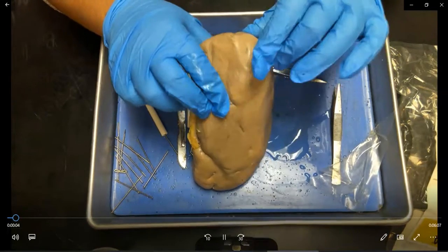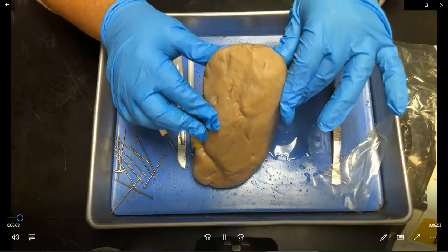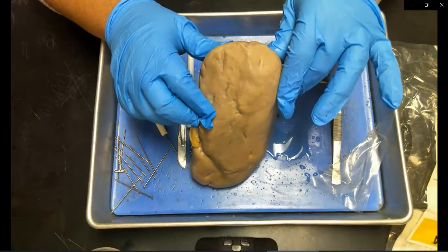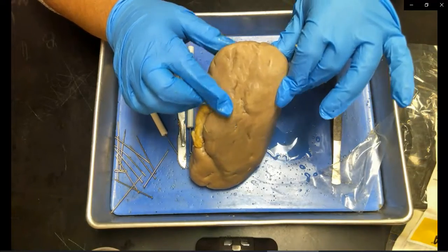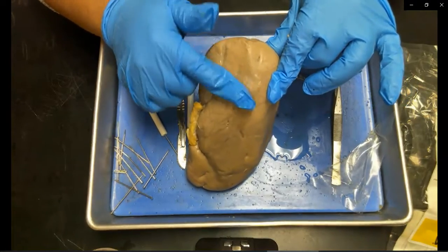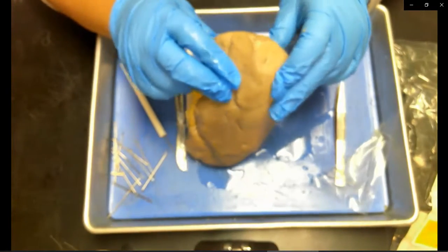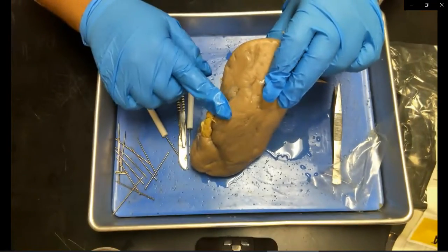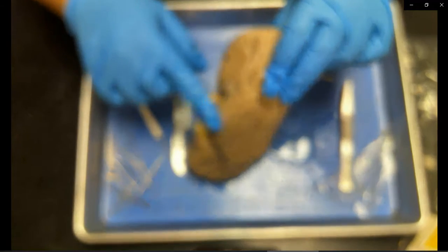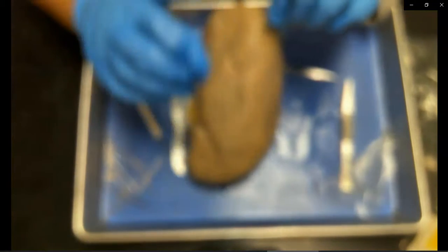Alright, hey guys, so I am going to do a dissection for you. This is a really large kidney that we found in the back of our anatomy closet. So this would be the top of the kidney. You see how it's kind of thin, and this would actually be the left side because you see that the ureters are coming off of the right here. So this would be the left kidney.